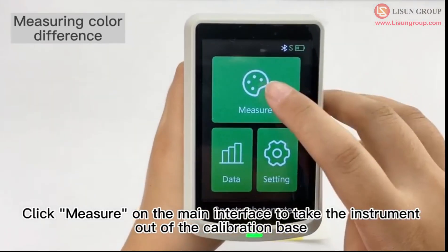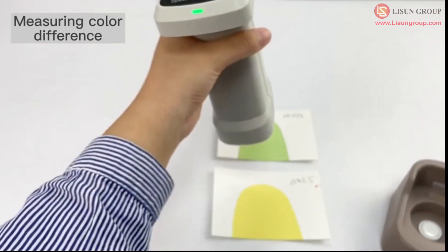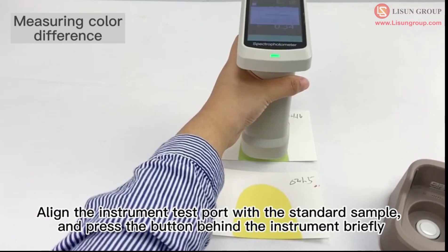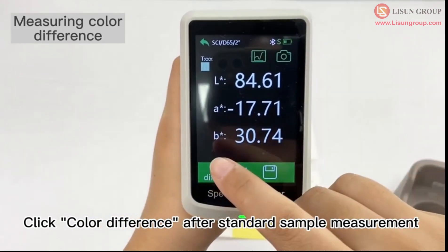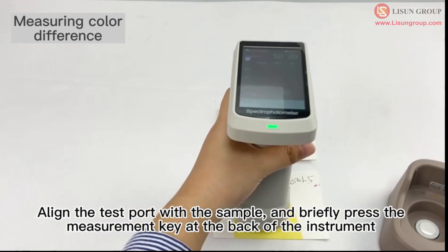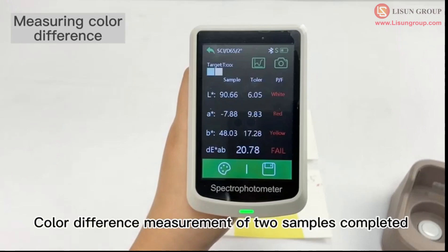Click measure on the main interface to take the instrument out of the calibration base. Align the instrument test port with the standard sample and press the button behind the instrument briefly. Click color difference after standard sample measurement. Align the test port with the sample and briefly press the measurement key at the back of the instrument. Color difference measurement of two samples is completed.